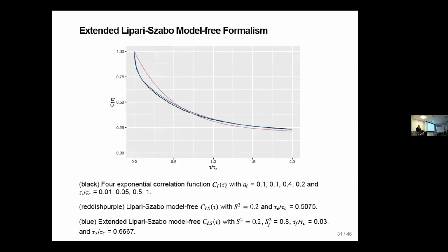Now, one clarification. So here the correlation timescales for internal motion have to be much faster than tumbling, what we said. So the Lipari-Szabo approach says the internal motions and overall motions have to be independent of each other. Actually, the approach assumes they were timescale separated from each other. In fact, most of the time, our tacit assumption is that they're timescale separated.